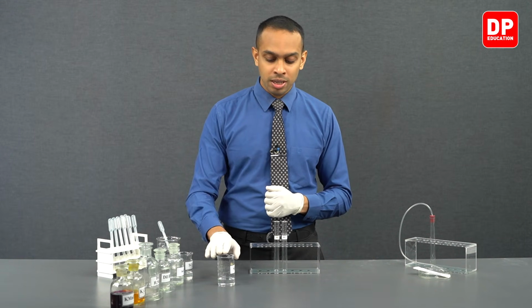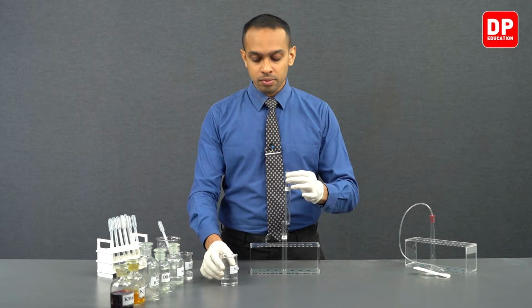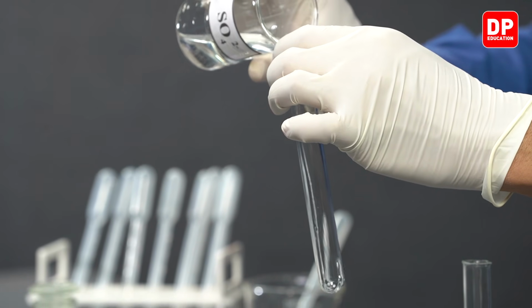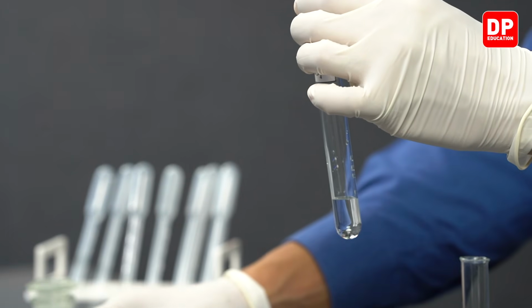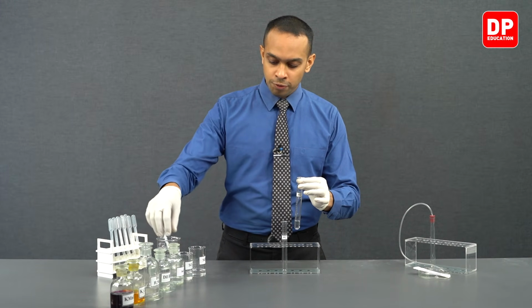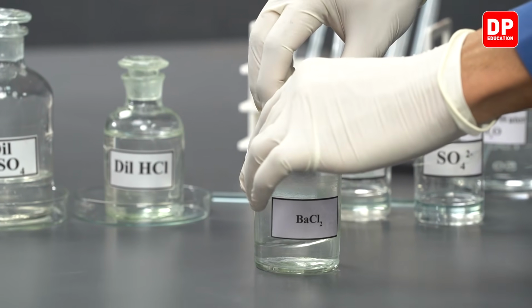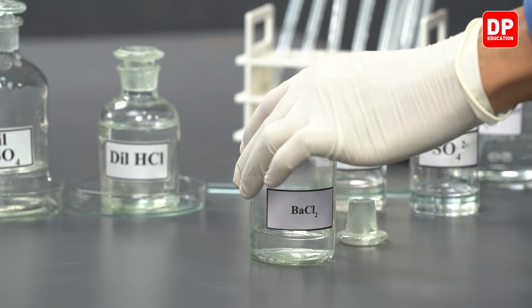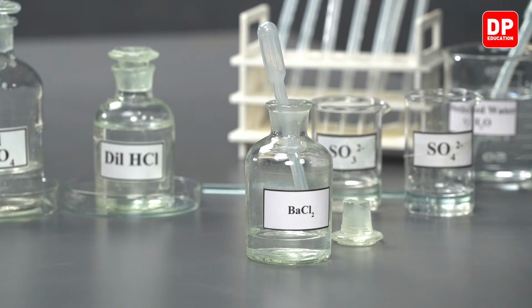So students, if you take sulfate ions into a test tube and then add barium chloride to it, you are going to observe the formation of a white color precipitate.